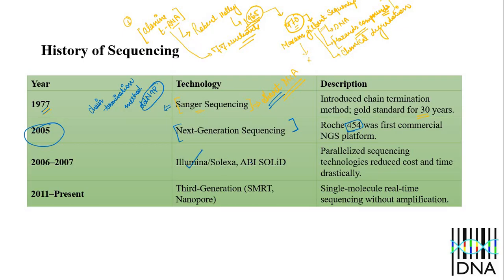Then SOLiD sequencing in 2007, and Ion Torrent sequencing in 2010.